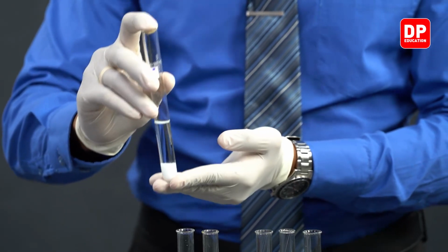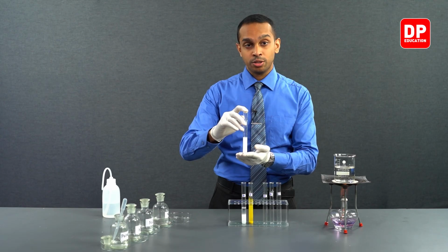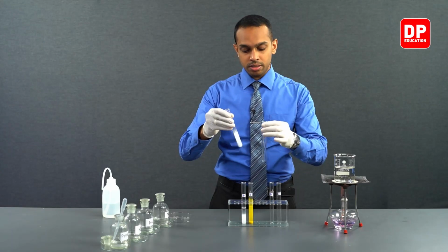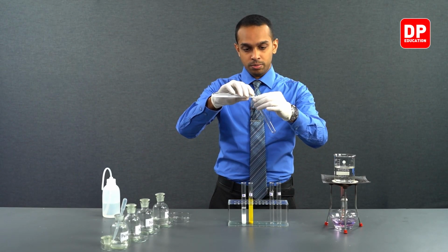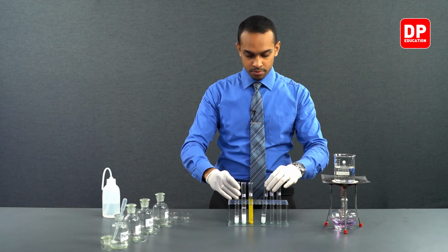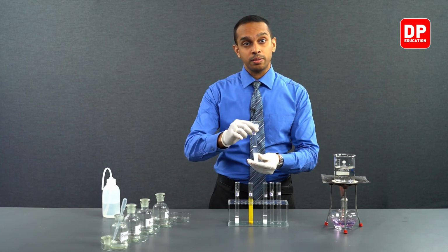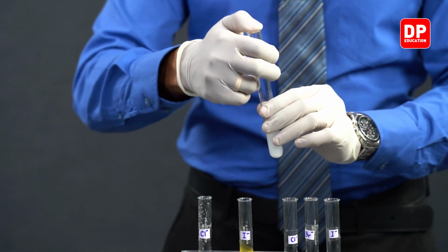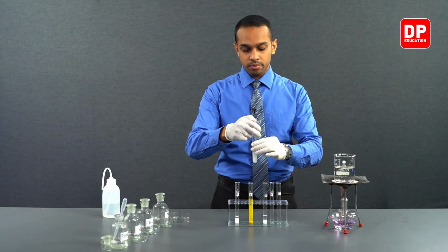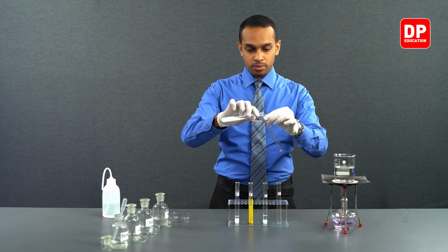So let's take the lead chloride precipitate, which is a white color precipitate, and let's mix it a little bit like so. And now let's transfer some of it to a different test tube. We'll do the same to lead bromide as well. This is lead bromide. Let's mix lead bromide a little bit and transfer some of this lead bromide into another test tube.